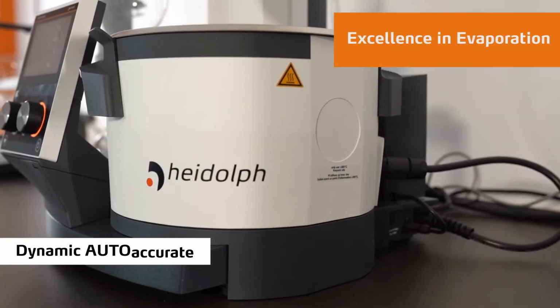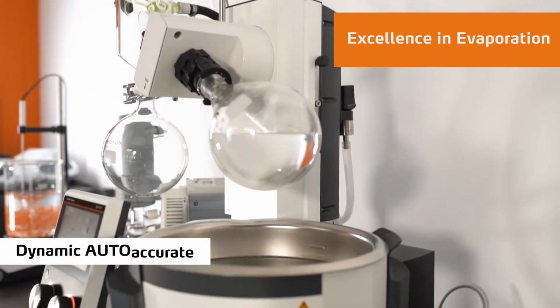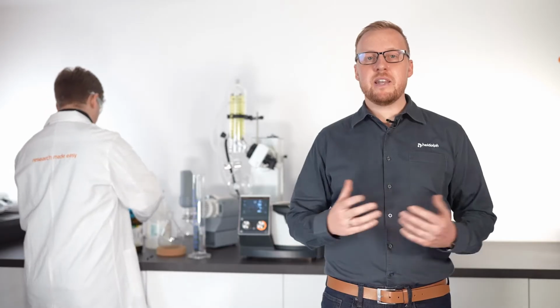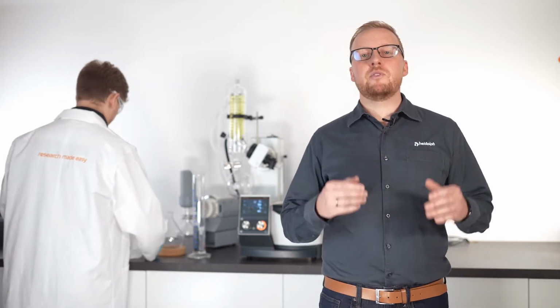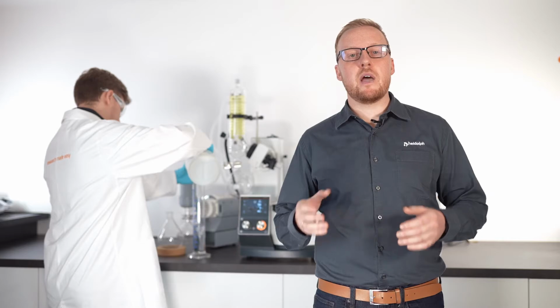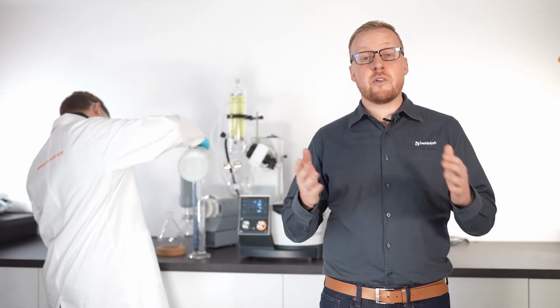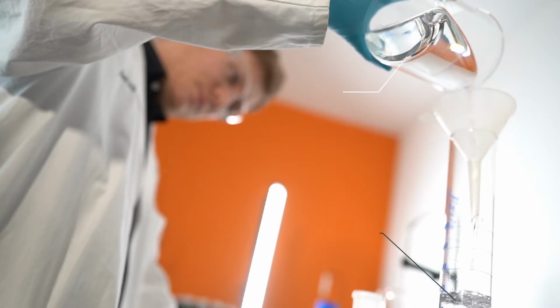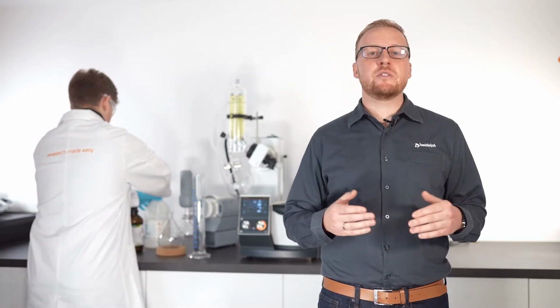Today we want to introduce a smart feature to automate some of the most relevant process steps of rotary evaporation processes. The dynamic AUTOaccurate, or short DAA mode, is a smart program to detect and to address a single or even a multiple boiling point automatically. In this video we will show you how this feature can boost the efficiency in your lab, can avoid undesirable side effects like foaming or bumping, and how it can ensure a stable, constant evaporation without readjustments or monitoring.